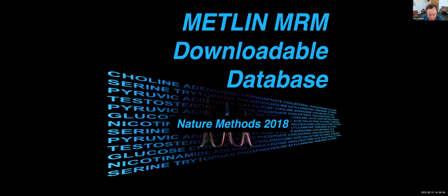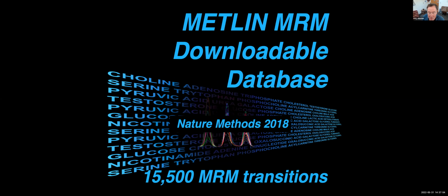One of the first ones we came out with was in 2018. This was the MRM download, of 15,500 MRM transitions. And actually, that's one that gets downloaded even to this day quite frequently. It's a fairly popular one.